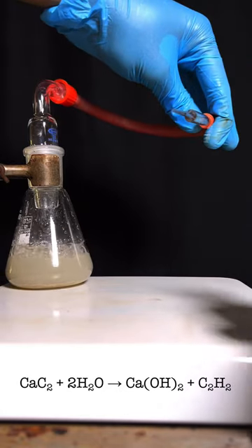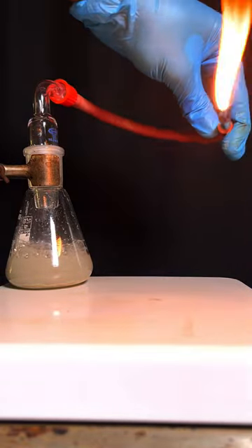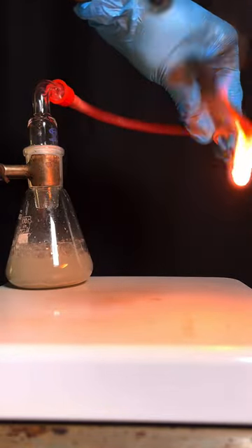Acetylene is flammable and burns with a yellow flame, producing lots of carbon, just like other aliphatic hydrocarbons.